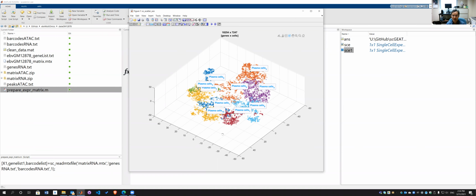So you have to make some adjustment, okay? For example, you have cells from a lung, and the first top annotation suggestion is from the liver cell, some particular types that are specific to other organs, not the lung, and you want to make adjustment. You may want to choose the second best hint of the annotation.